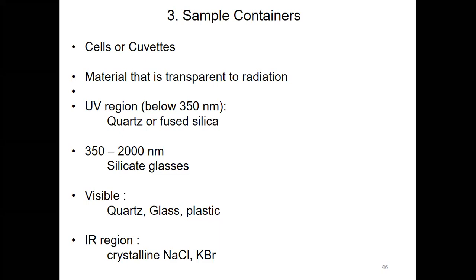So whatever the radiation we are using, let's say UV, IR, or X-ray, the material of the sample container should be transparent to that particular radiation.